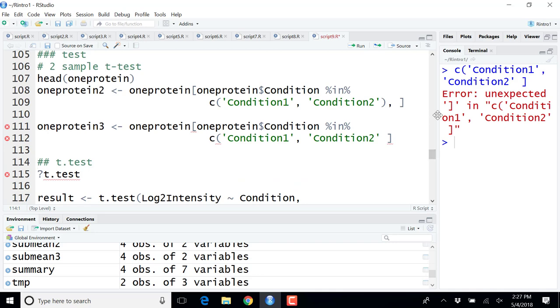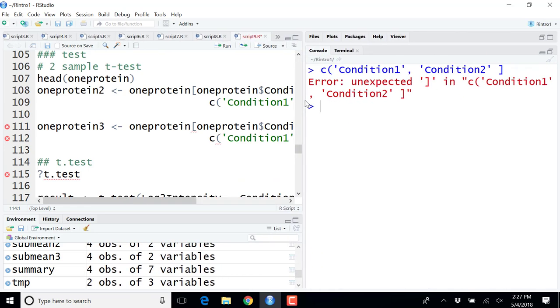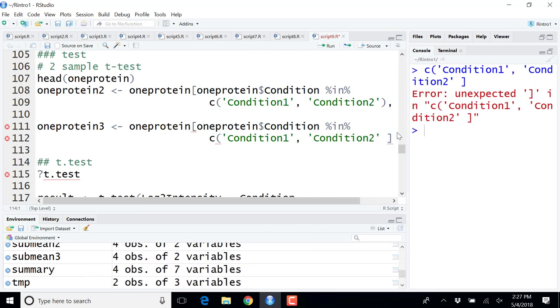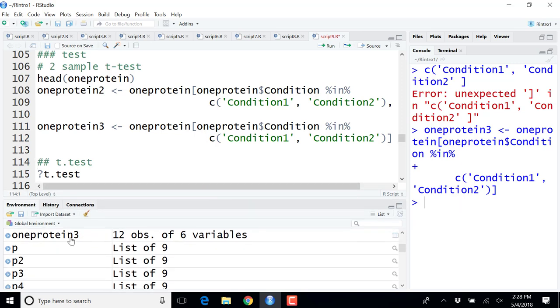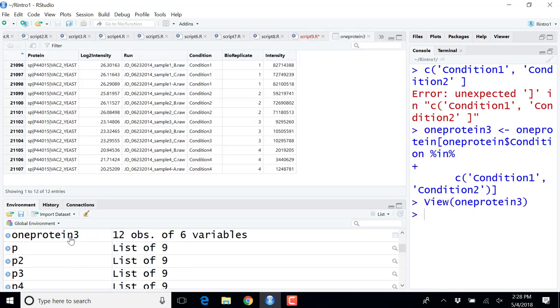In my case, I have an error message. Let's try to make. Oh, okay. Here I remove this. Okay, let's try this. Then here, right? The open. Right.